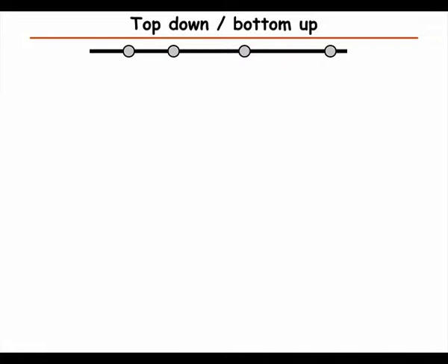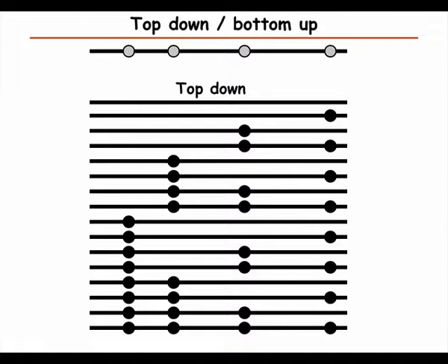So far we've mainly talked about bottom-up proteomics, and what people mean by that is that you digest with an enzyme and you look at the enzyme pieces, and you usually digest with trypsin, which gives you quite small fragments. But in particular, when you're interested in modifications, you might be interested in the way they correlate over a bigger part of the sequence.